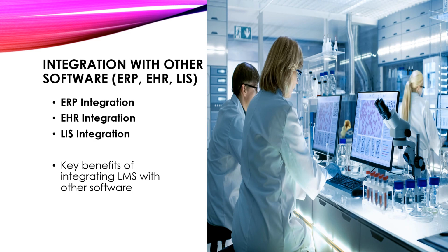Integration with other software such as ERP, EHR, and LIS. Now, integrating laboratory management system with other software such as enterprise resource planning, electronic health records, and laboratory information systems can significantly enhance efficiency, data accuracy, and collaboration across different departments within a healthcare organization. Now, this is how these integrations work.